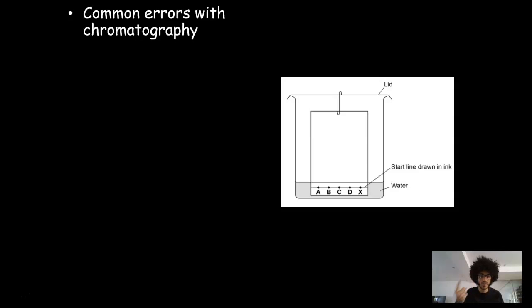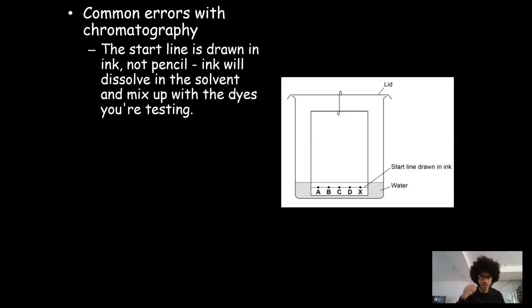Now, you need to be able to do two things. First, identify what those errors are. And secondly, you need to explain why they're bad, why they're a problem. So in this particular diagram, you can see that the start line is drawn in ink, not pencil. That's really bad, because then what will happen is that the ink will dissolve into the solvent, and it'll mix up with all the dyes that you're testing. So you'll just have this splurge of color, and it won't be very good. So that's a problem. So you always have to draw in pencil, not pen.